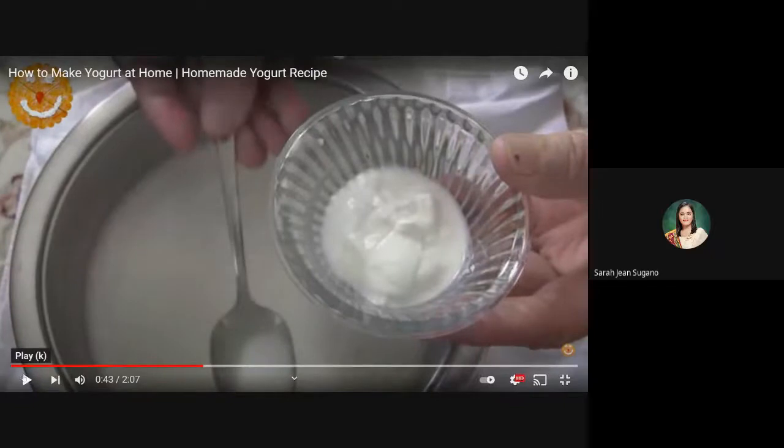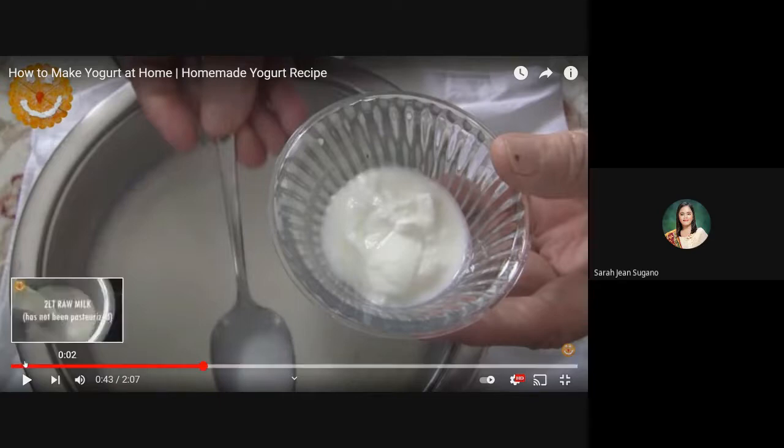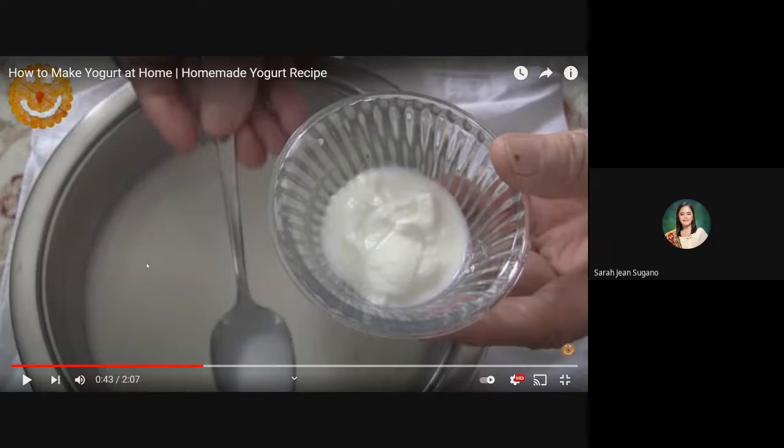So after pasteurization of the milk, you have to allow your milk to cool first before adding your lactic acid bacteria. If you don't do homogenization anymore, because other processes will undergo homogenization to break down fats. But if you are doing it at home, others don't have the equipment, like homogenizers. So you just have to skip that process, and then after pasteurization, you add your lactic acid bacteria, but you have to allow your milk to cool in order that the lactic acid bacteria will grow.